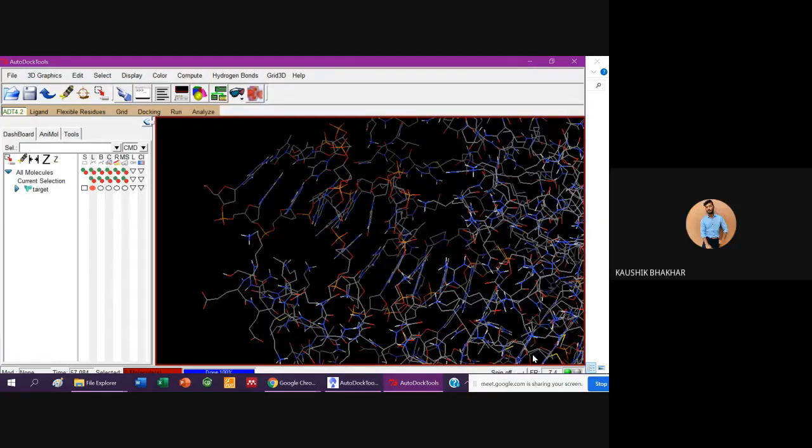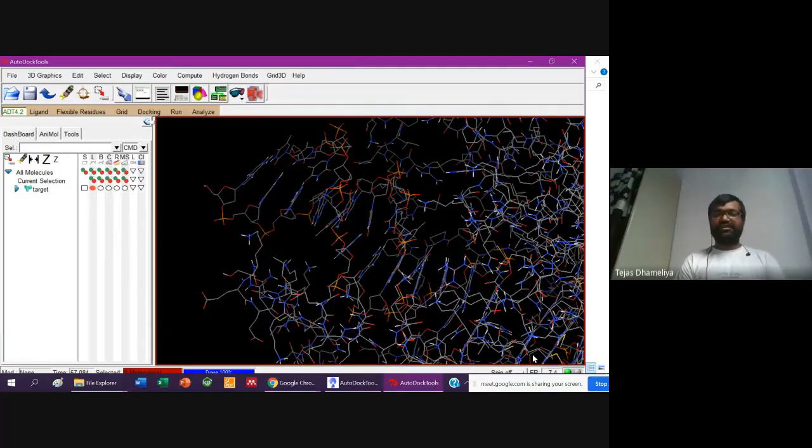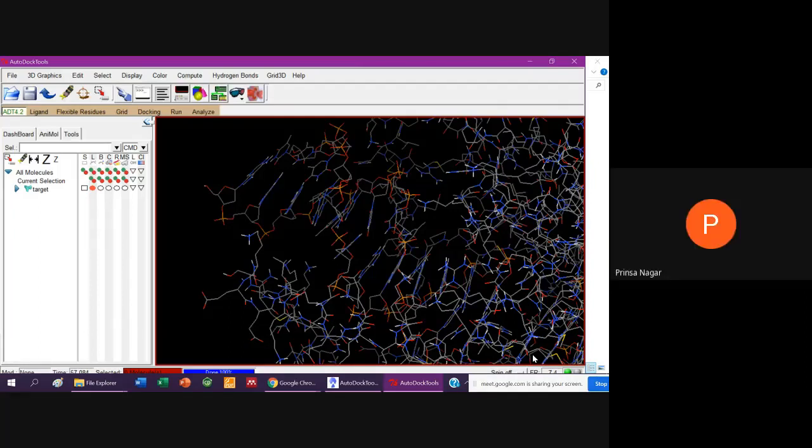Yes, sir. Preparation of the protein, yes sir. I hope that is also clear. Whenever I'm explaining, make notes with you. Although I will share the PDF with you, you should also go on noting the commands. Yes, sir, I'm already noting.